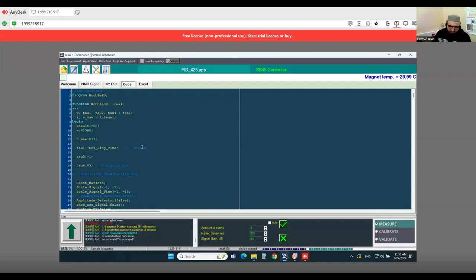But for this, because this sample was also at room temperature, hopefully we can wait for 3-4 minutes. The temperature will adjust, so after that we will go.